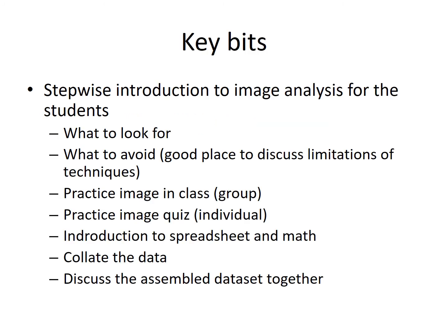So the key bits, I started off with the key bits for doing an image analysis project with the students virtually. I think the key steps here is to start off by helping the students understand what to look for and also what to avoid. These are really great places to discuss the limitations of the techniques and what the artifacts might be in the image. Another key step is to practice an image as a group in class for the shy people.